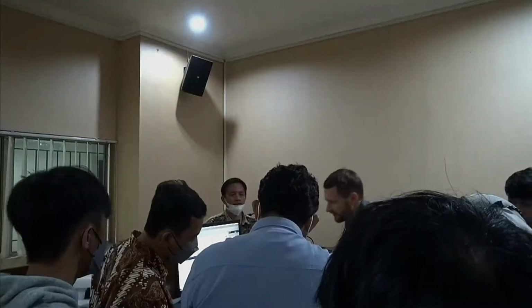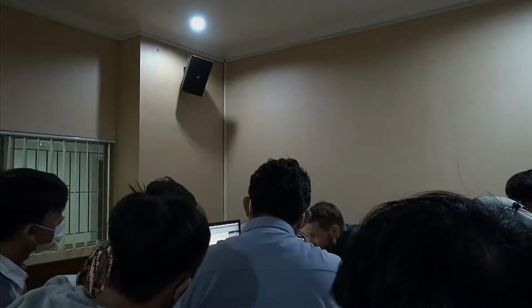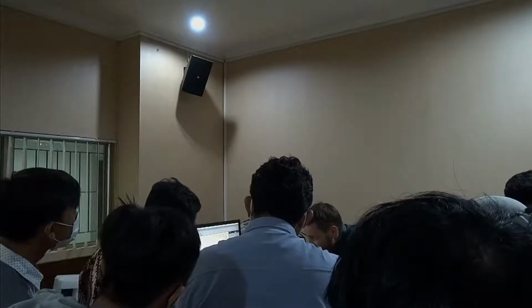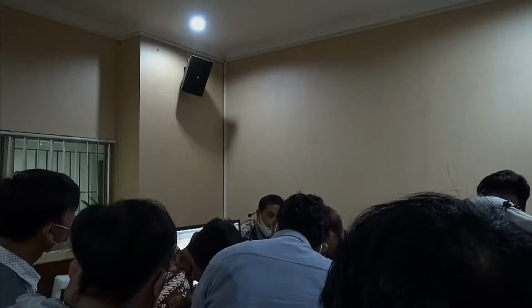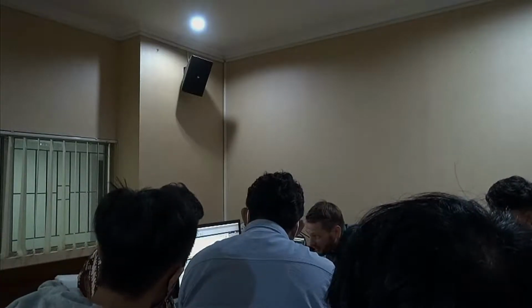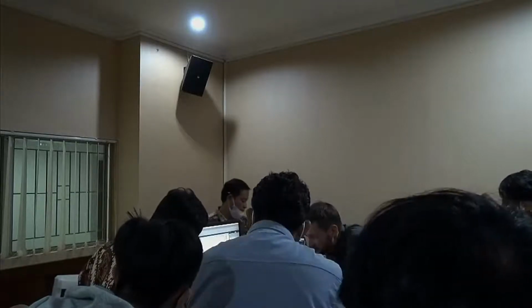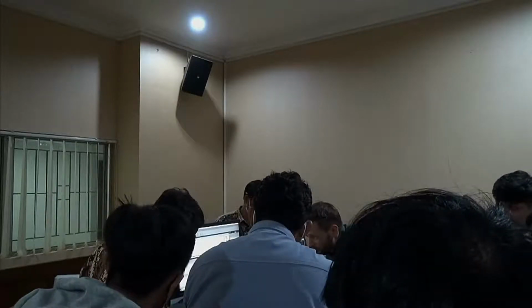So again, 3 reproducible measurements, not as reproducible as the previous 2 samples. Already here you can see a difference in color. Okay, it's not that bad actually. It's a little bit higher than the other ones if you check the variation coefficient, but still pretty nicely.